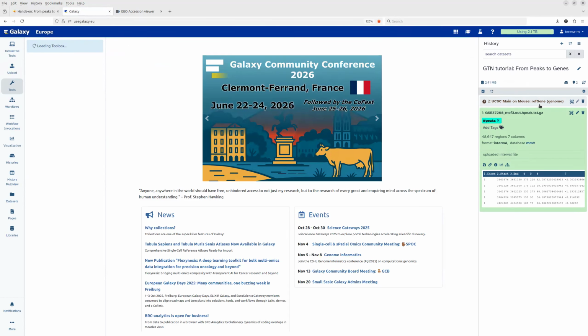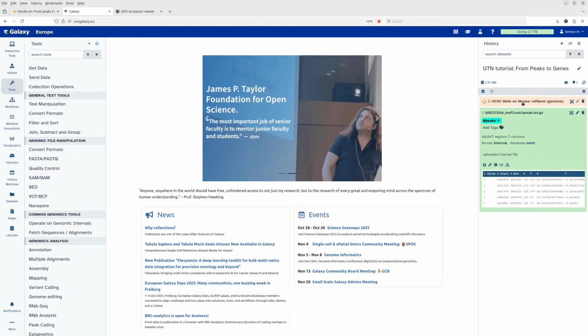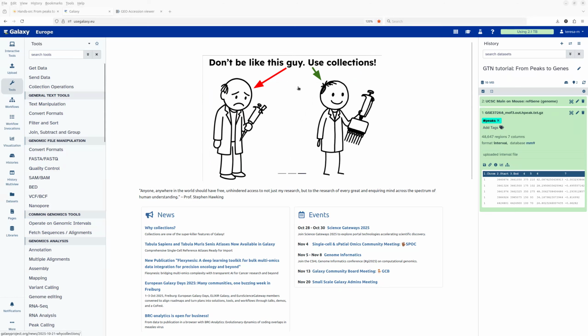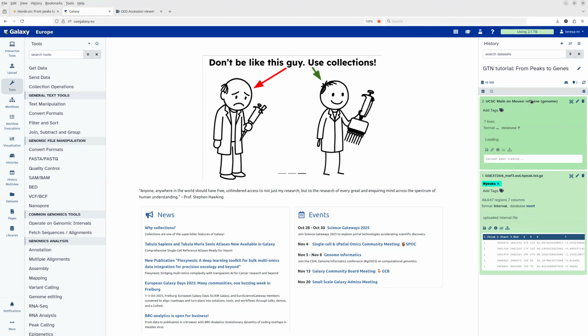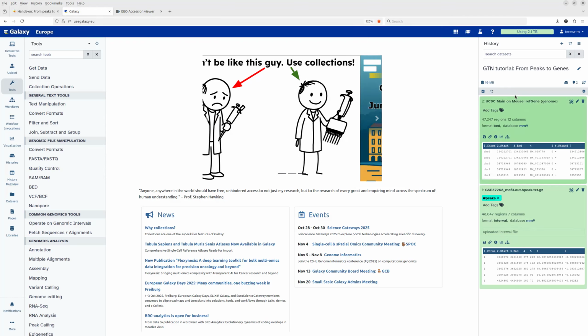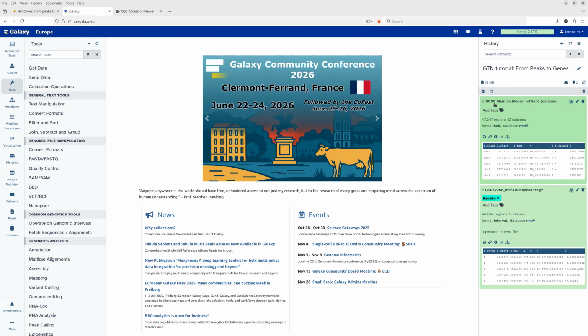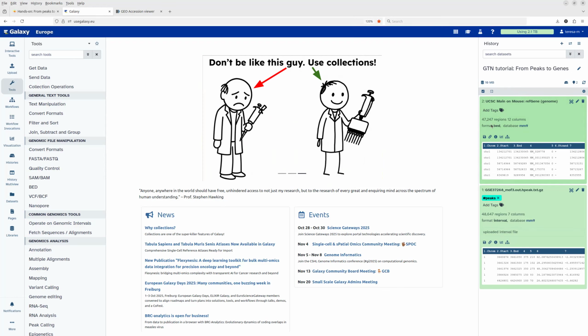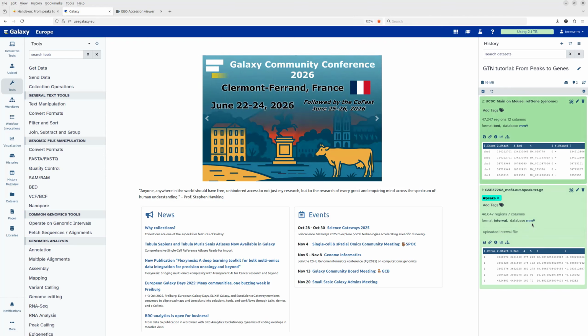You see that I have a gray file here, which is uploading now. So I will pause the video again for a little bit and come back once it's uploaded. Welcome back. My file is now uploaded and we can have a look and expand the information of the file. So we have the output from the UCSC main tool, which is also the title of this file. And the format is BED format and database is MM9 as our peaks file.